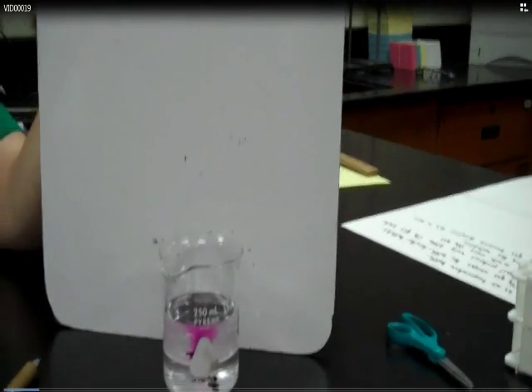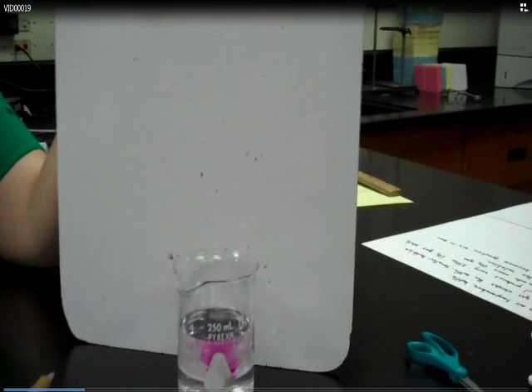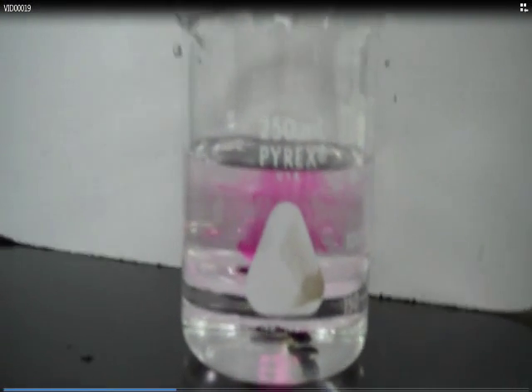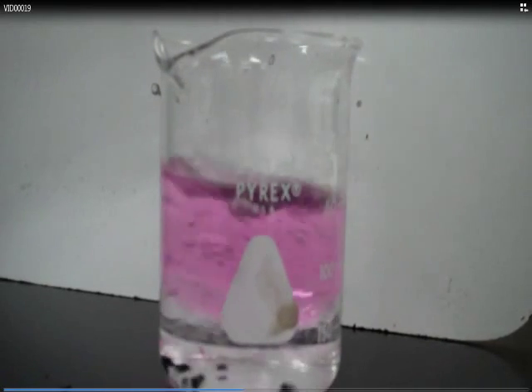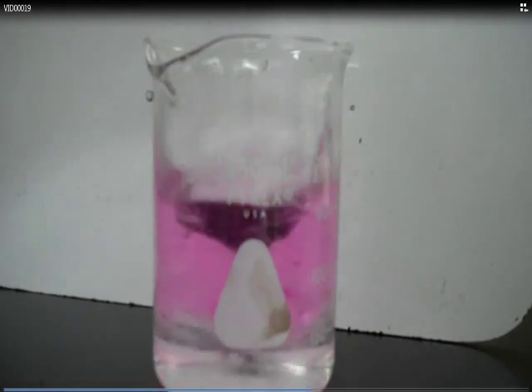Okay, what we now have is we've placed some elemental iodine, which is I2, nonpolar crystals, into this mix of the hexane and water to try to determine which layer is hexane. Iodine, because it's nonpolar, should dissolve in the hexane layer. Stir away, Mason. Vigorous, vigorous.